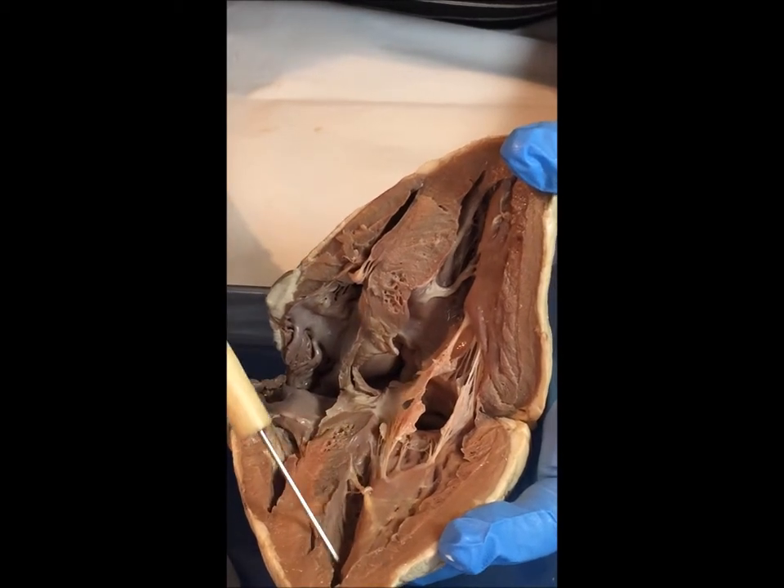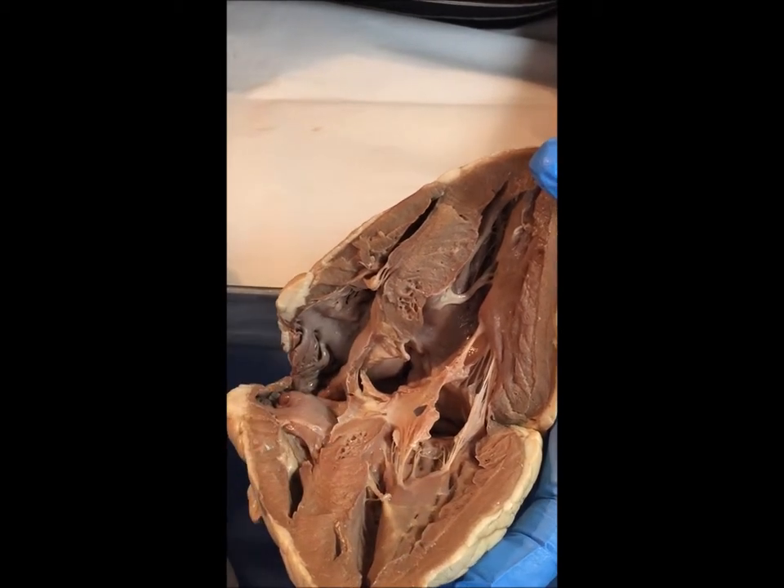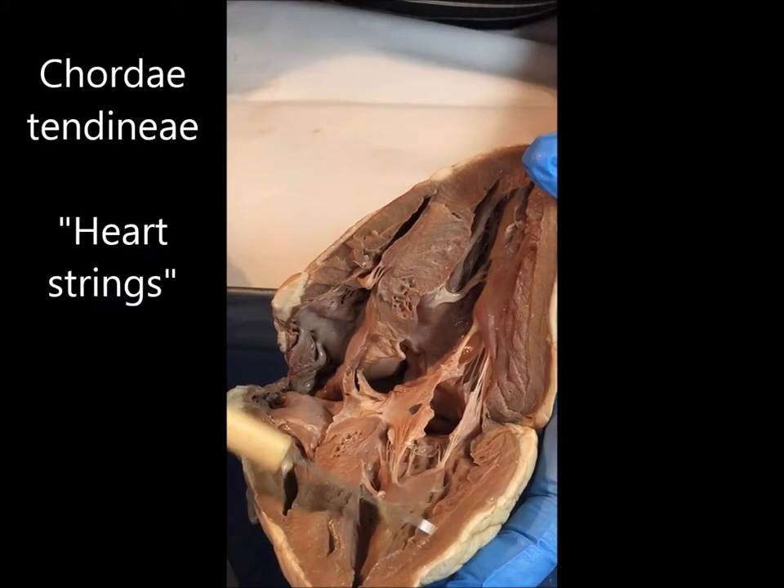Here we have the left ventricle. You'll notice how much larger or bigger the muscle is on the left side than on the right side, because the left side of the heart has to be able to withstand more blood pressure.